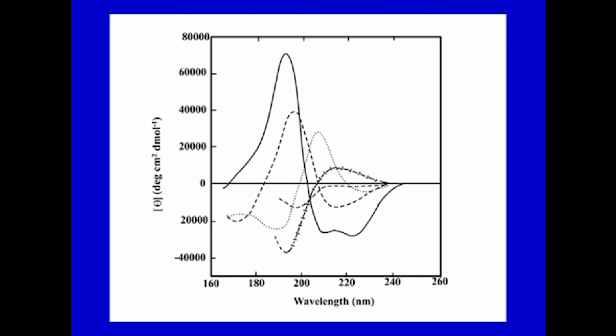All right. So, as we have seen, characteristic CD spectra for protein, and the kind of transitions which happen in this spectra, which is the UV spectra, ranges from around 160 nanometer to 240 or 250 nanometer.